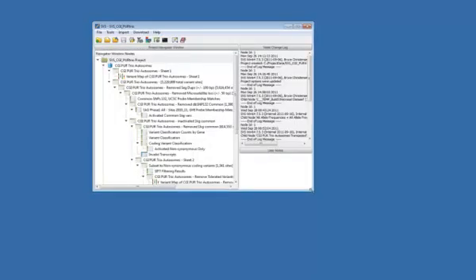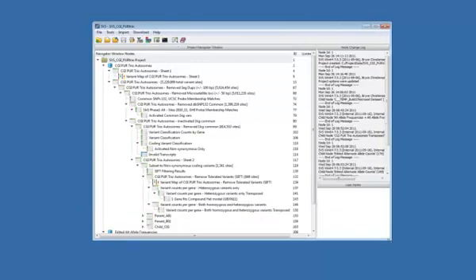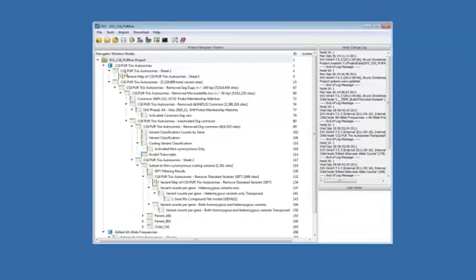And we now see the Project Navigator. This is a listing of spreadsheets or data nodes that exist within this project. There are also some nodes for Genome Browser windows and perhaps other visualizations.